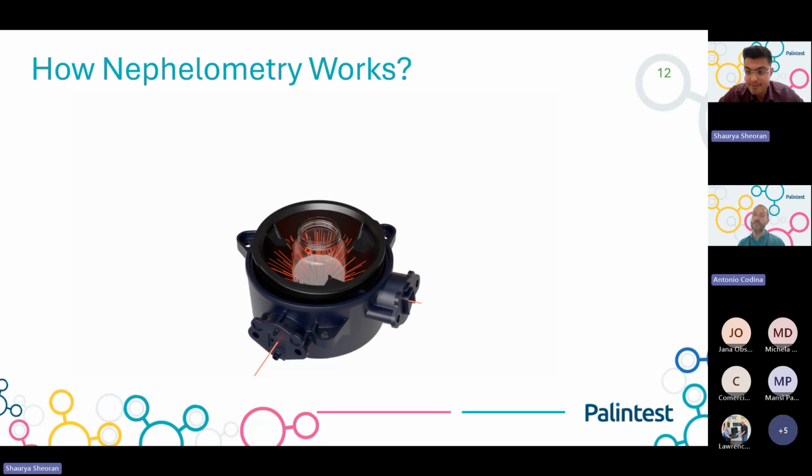Andrew is asking about the importance of turbidity measurements in the Czech Republic, which is a question for Karel? Andrew, can you confirm? Yes, so we can always follow back on that, let us review the regulations. Usually, this is driven by the regulatory landscape. There are European Union guidelines which are used by many of the countries. So based on that, we can come back to it. In the UK, we have 1 NTU when it leaves the treatment works and 4 NTU when it reaches the taps. However, it does depend on the jurisdiction you are in.